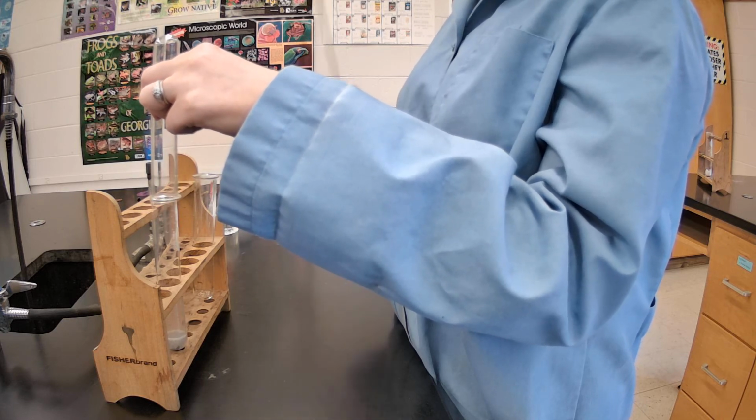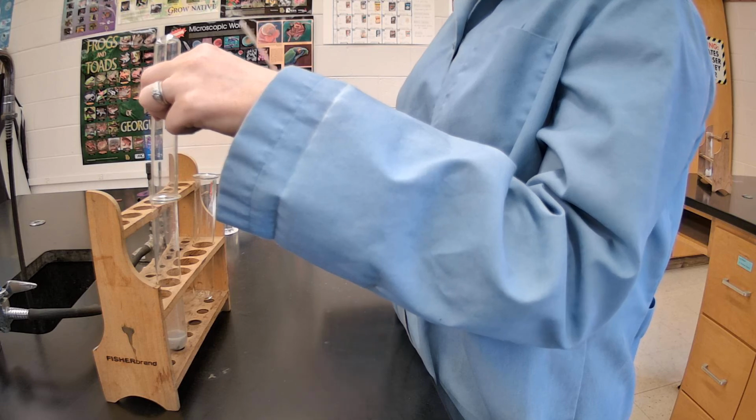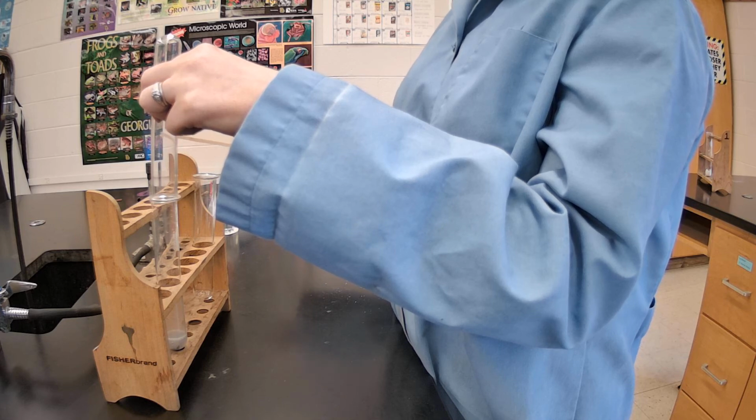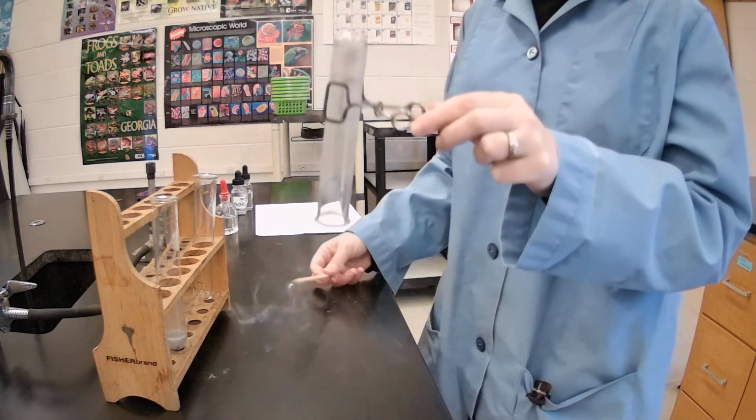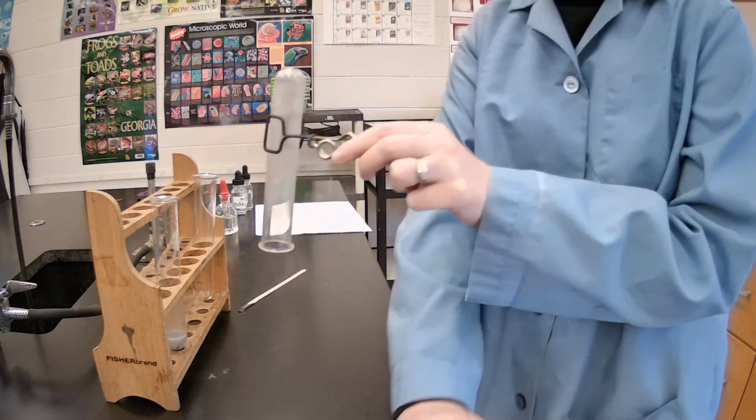So let's find out. I'm going to take my wooden splint and light it in my Bunsen burner just like I showed you before, and hopefully we get that yipping pop noise. Let's see. And there we have it. We have hydrogen gas present.